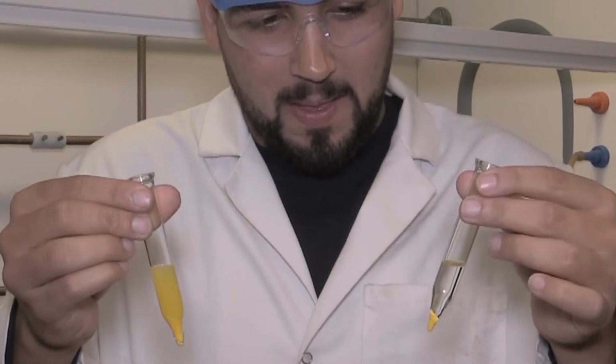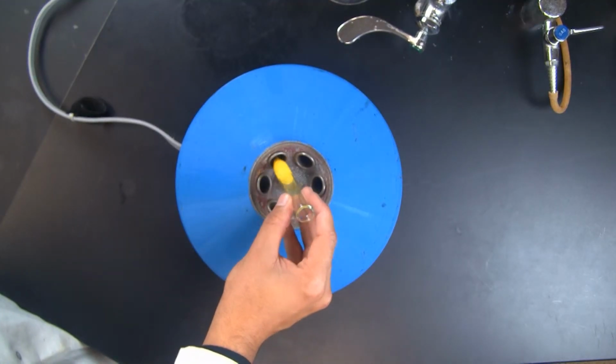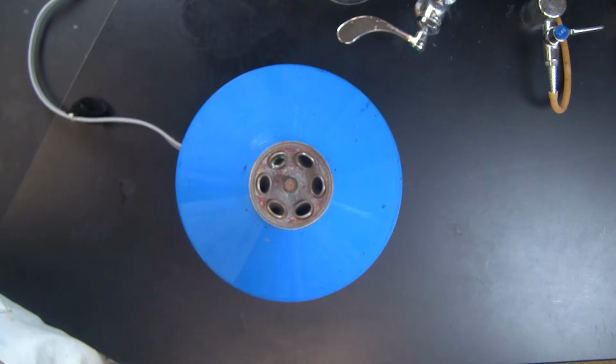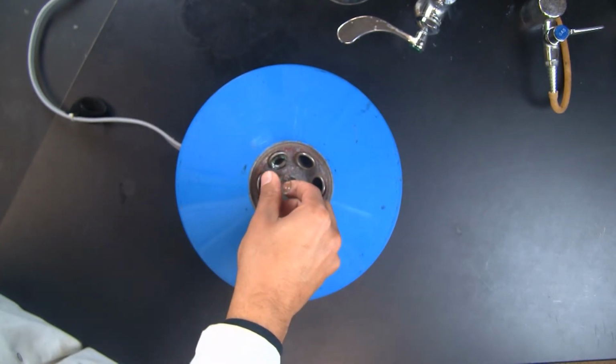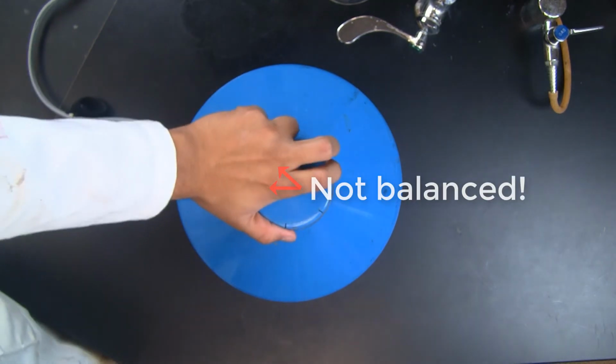Ever wonder what will happen if you don't balance your centrifuge? To save you the heartache and shame of having your centrifuge run right off the lab bench, we've taken the time to give you a preview. Just in case something goes sideways, we'll put the lid on this time.